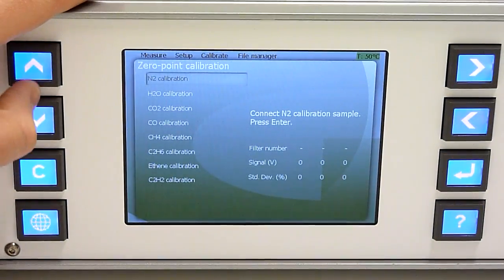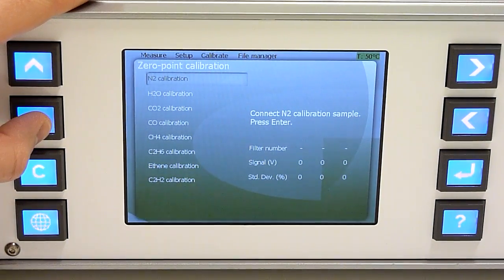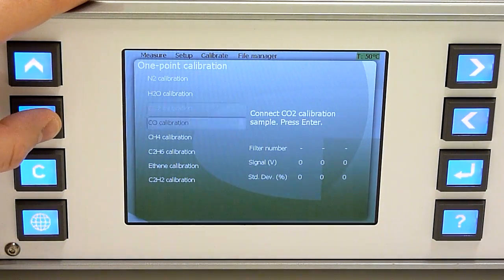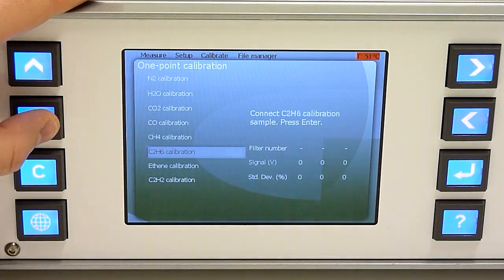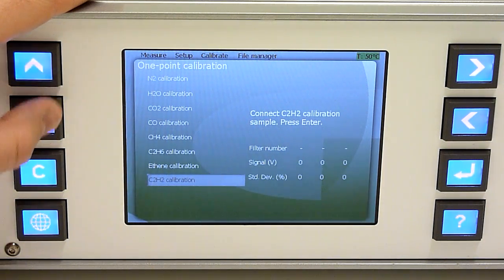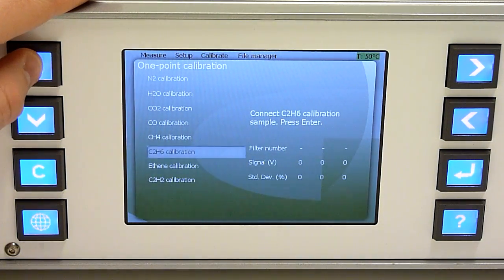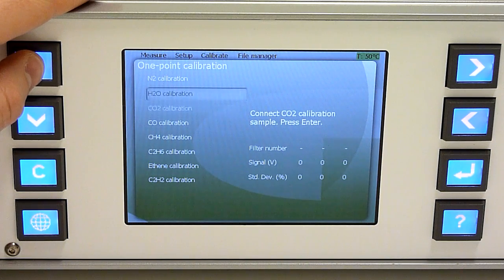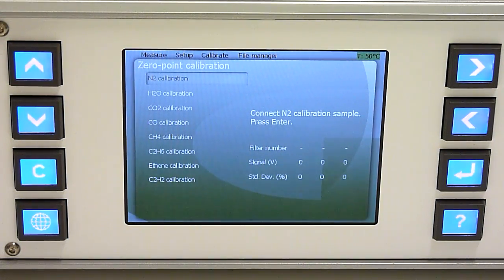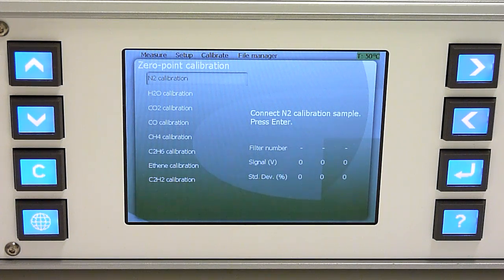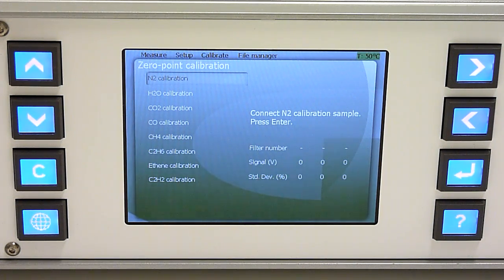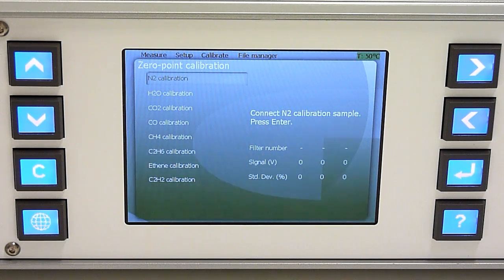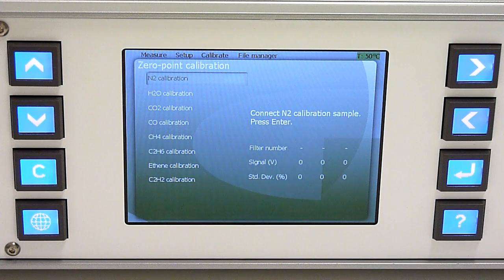And now it should be noted that you can calibrate the instrument one gas at a time, including the background, in a random order at a random time. So there's no need to go through the list at once.